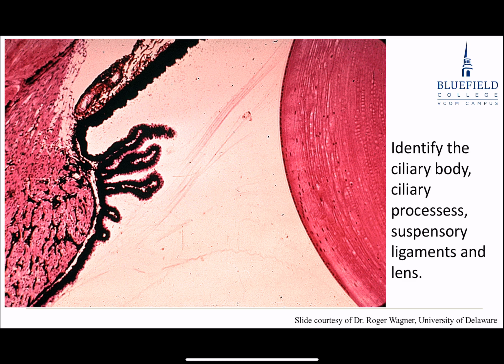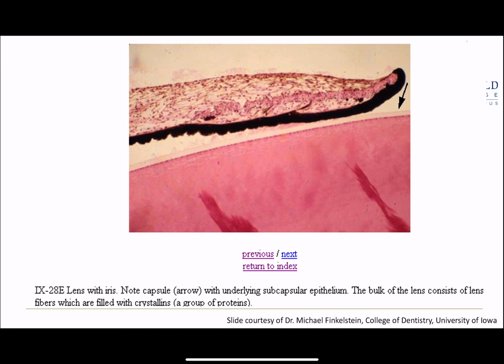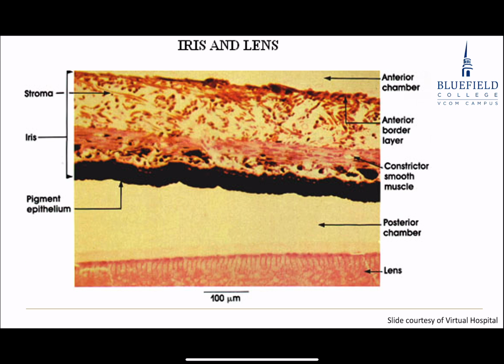Right, here's one with a lot of labels to it now. And no epithelium up on that surface. You can appreciate this on this nice high resolution, high power magnification. And then I've got stroma. I've got some, in this case, constrictor muscle here within the stroma. And then the posterior surface is that cuboidal epithelium, so highly pigmented you can't make out the cells.